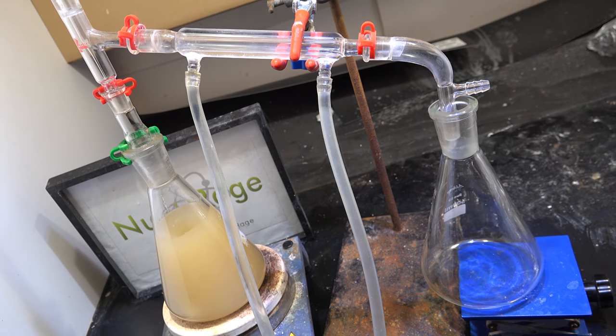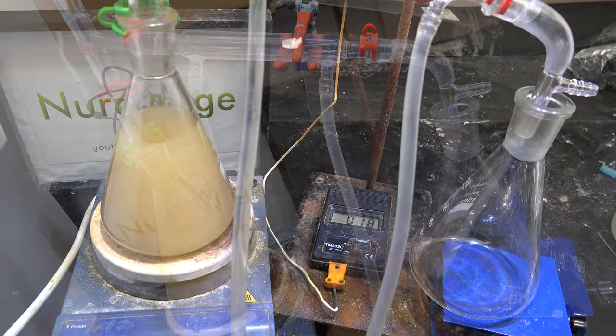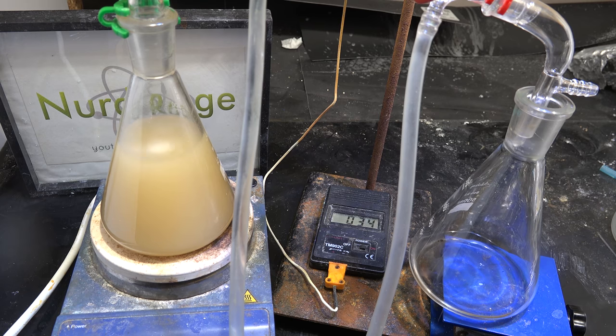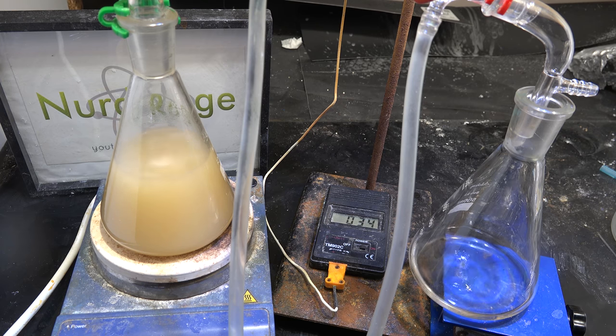Now we set up a simple distillation apparatus and gently distill off the diethyl ether. Remember to use thoroughly dried apparatus so we don't reintroduce water contamination. I know spending over a week to purify diethyl ether seems excessive, but this batch was highly contaminated. Ether usually only takes a couple of days to purify.